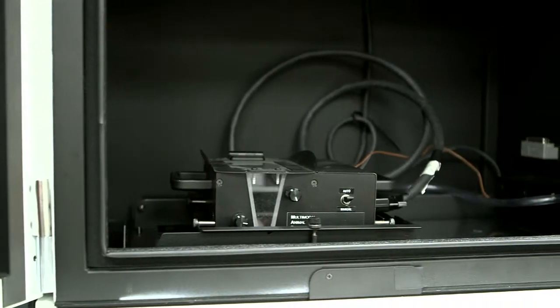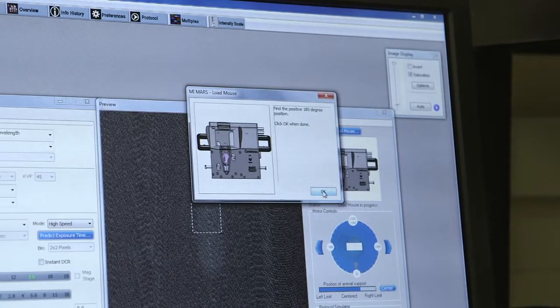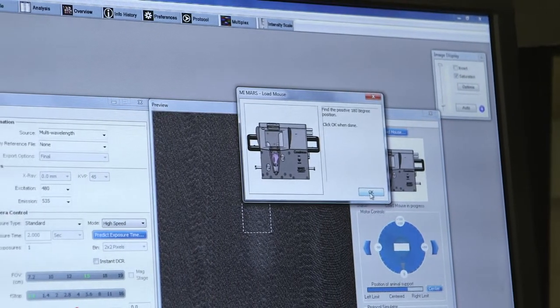Now let's talk about the Xtreme. This is an awesome imaging platform that gives you 4 modalities within one instrument: planar high-resolution X-ray, whole animal fluorescence, luminescence, and radioisotopic imaging. So this gives us range to a number of application areas, particularly within oncology, neuroscience, and probe development. And we're very excited to have that at Notre Dame as well.